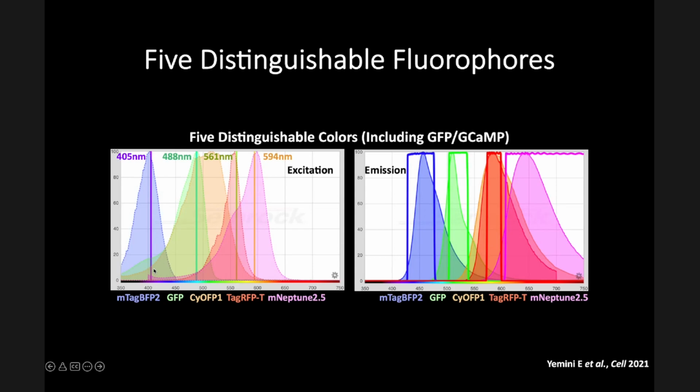Okay. And the problem with two photon and multi-photon, the theory, although I've never tested it, and sometimes you find that the theory doesn't hold that much, it still works maybe, but I don't know in this case, is that it smears, it broadens the excitation spectra. And now what'll happen is, you'll note that there's two reds that come through this red filter, right?